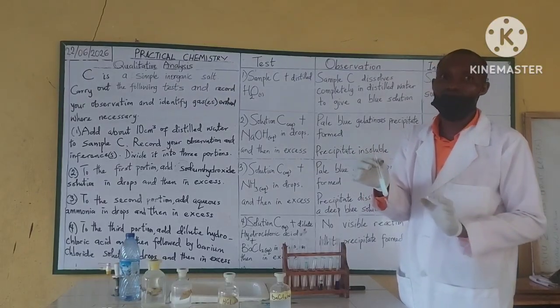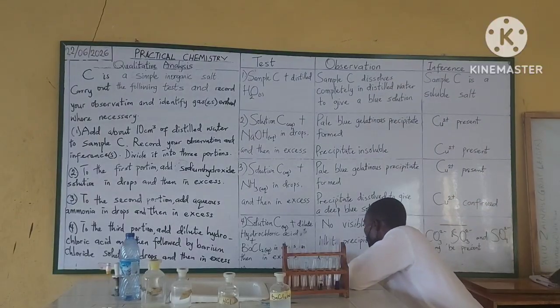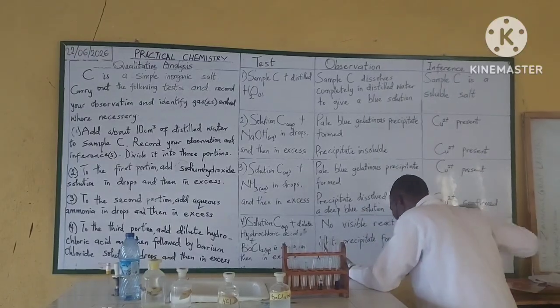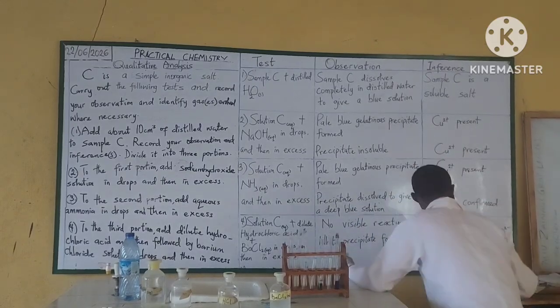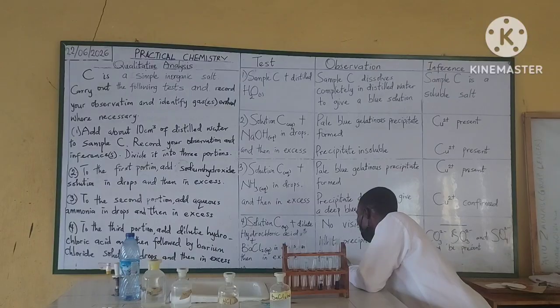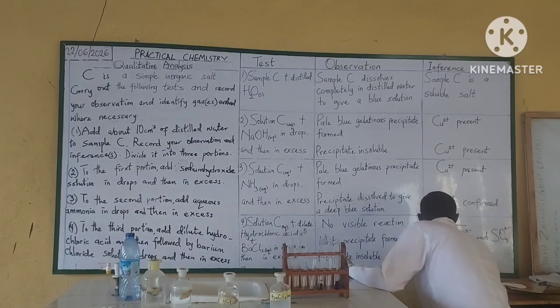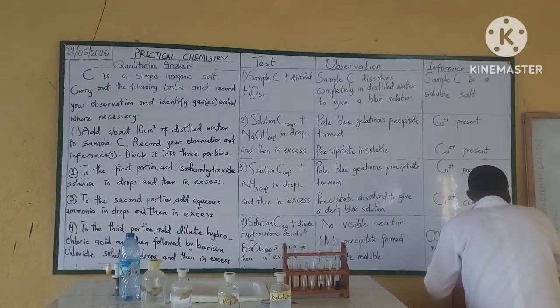Any of the two is acceptable. Then you can now say, once it is insoluble like this, it is SO4 2-.